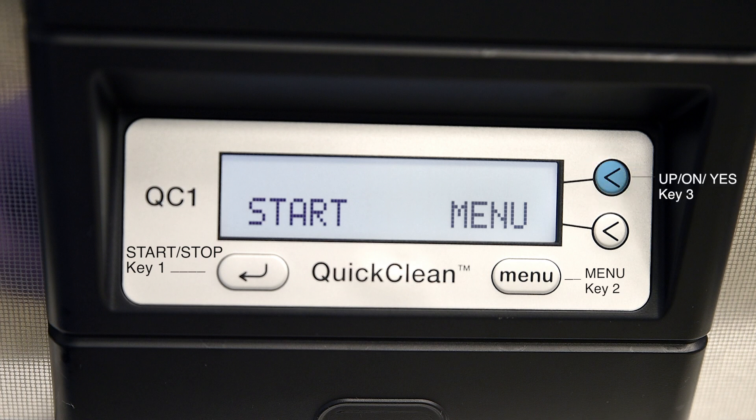Key 3, the top less-than key, functions with the up, on, and yes commands. Key 4, the bottom less-than key, functions with the down, off, and no commands. All screens are simple to understand and easily adjust to your desired settings.